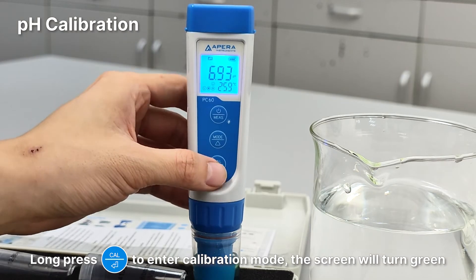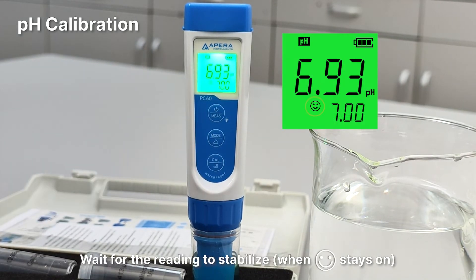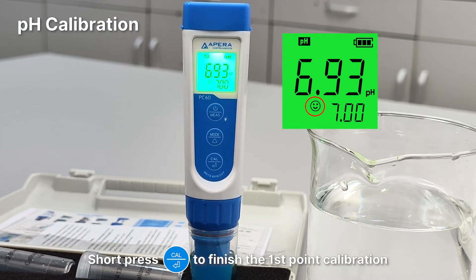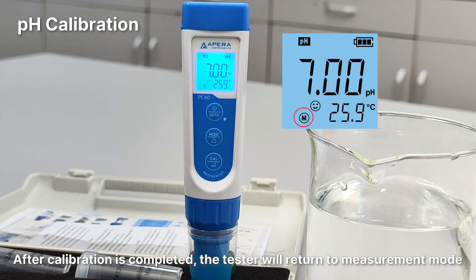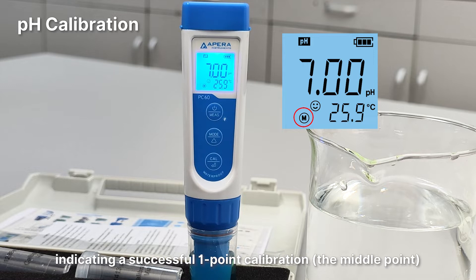Long press the cal button to enter calibration mode — the screen will turn green. Wait for the reading to stabilize. When the smiley face stays on, short press the cal button to finish the first point calibration. After calibration is completed, the tester will return to measurement mode. The M icon will appear at the bottom left, indicating a successful one-point calibration.